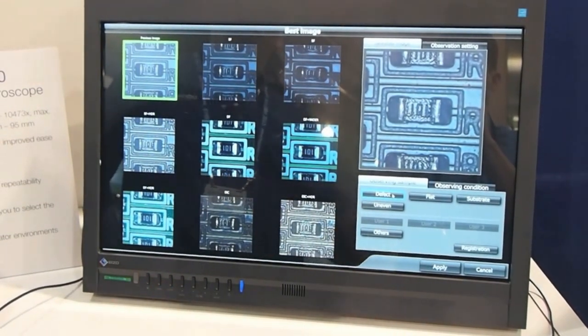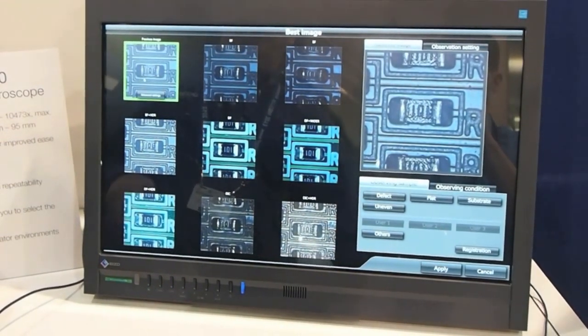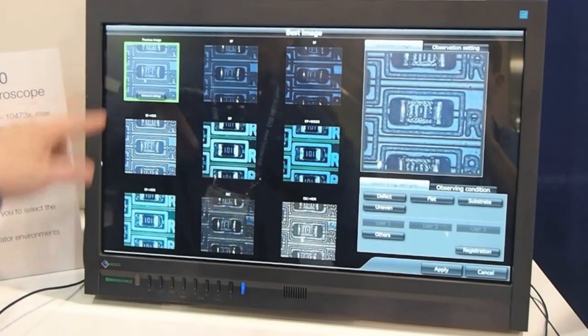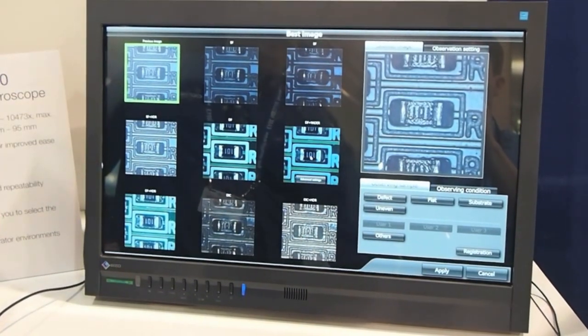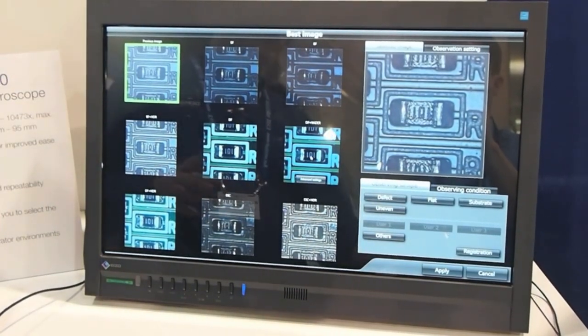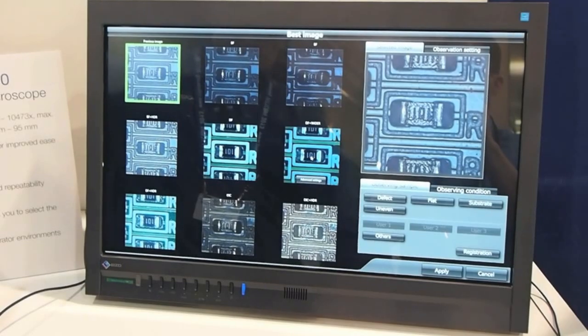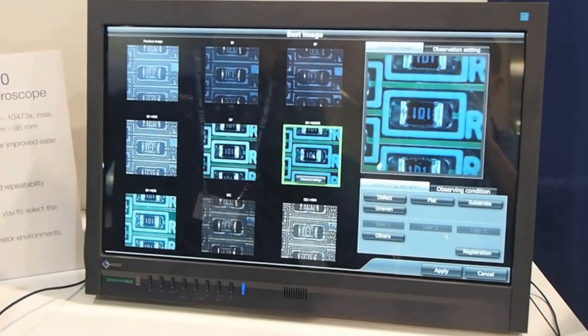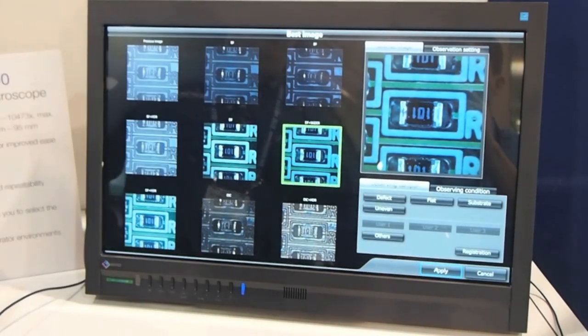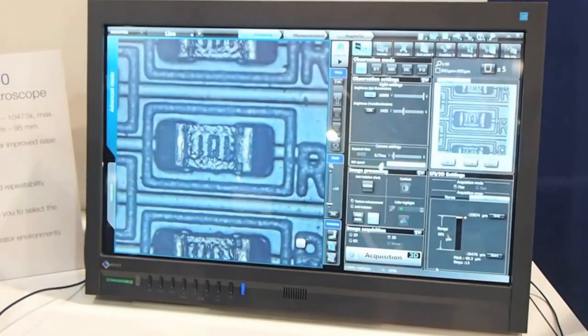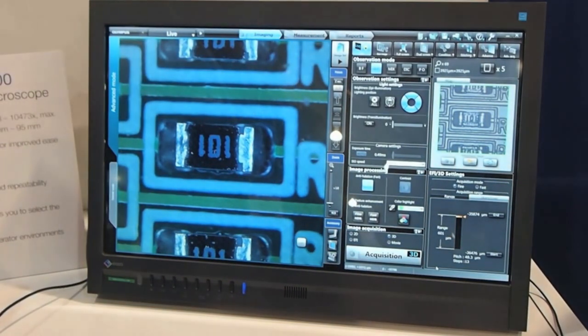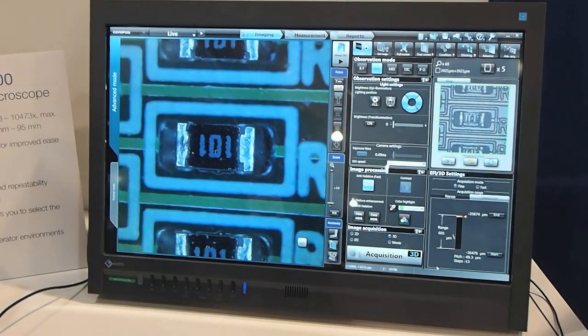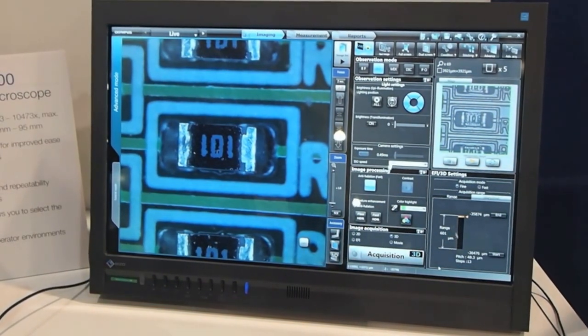We can compare our original image to the options and select the preferred one. Here we prefer dark field with wider anti-halation. By picking that option and applying it, the microscope reconfigures to that technique, giving us our best image.